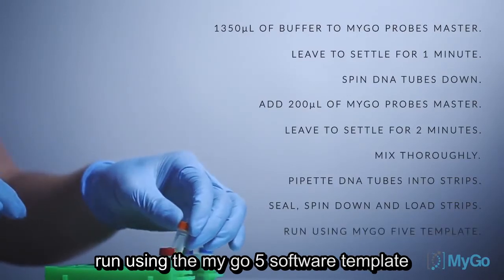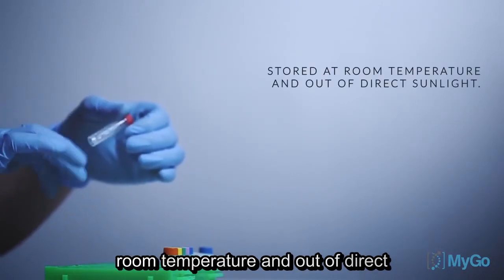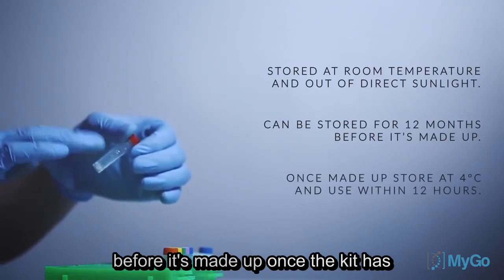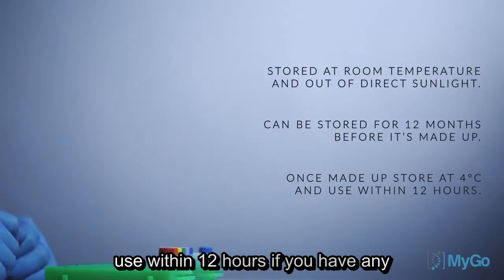Start the run using the MYGO 5 software template. The MYGO 5 demo kit should be stored at room temperature and out of direct sunlight. It can be stored for 12 months before it's made up. Once the kit has been made up, store it at 4 degrees C, and use within 12 hours.